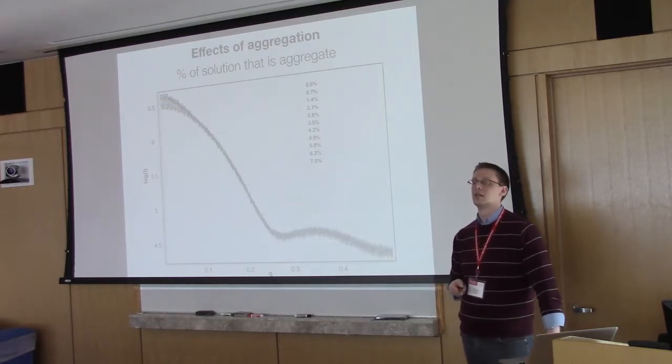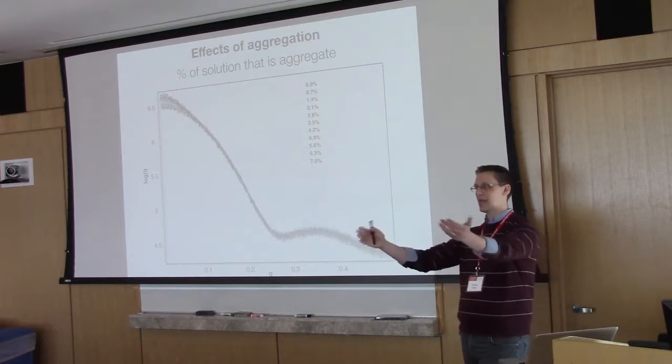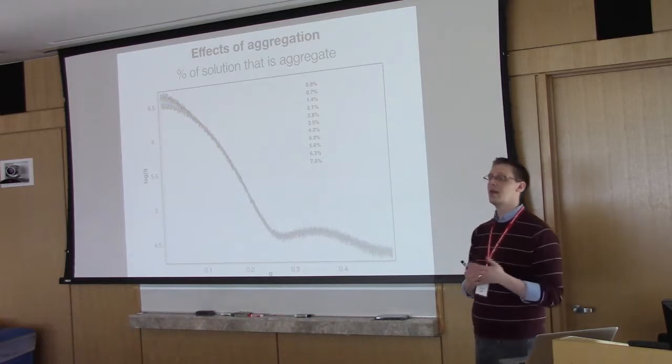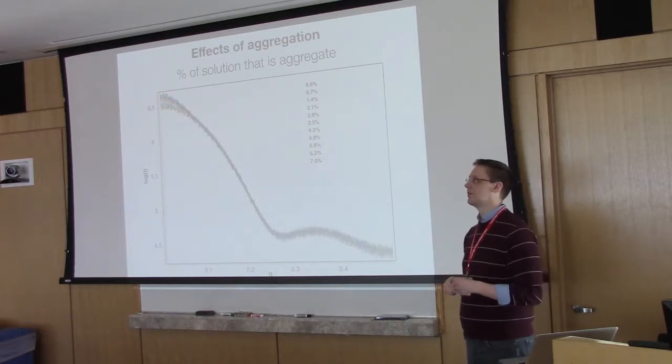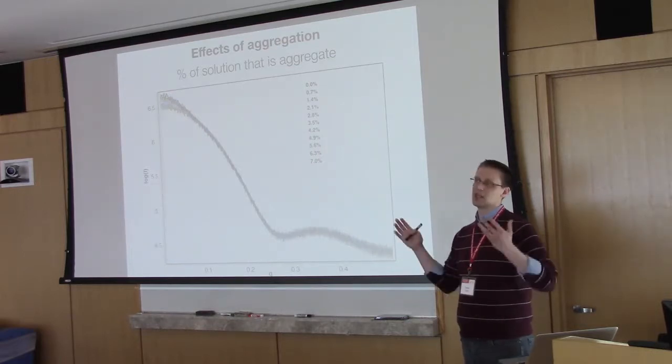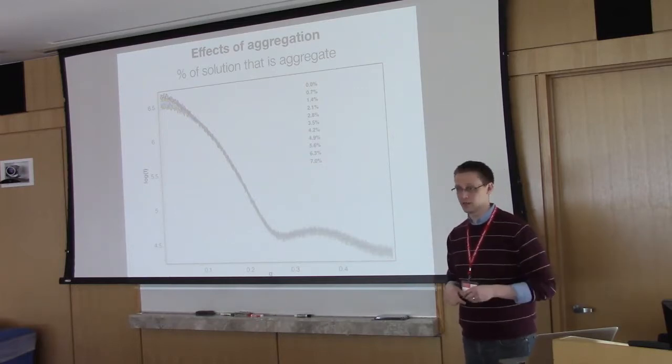How big are the beads? It depends on the size of the particle. It determines this as a balance between speed of the program and sampling in real space. You could have 100,000 beads, and each bead could be 1 angstrom, and it would take 10 days to run.